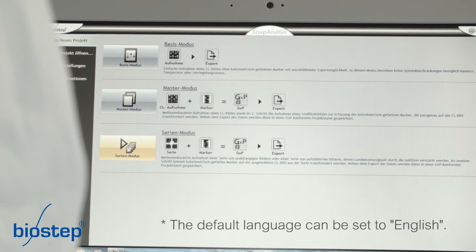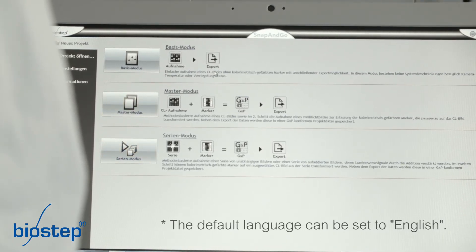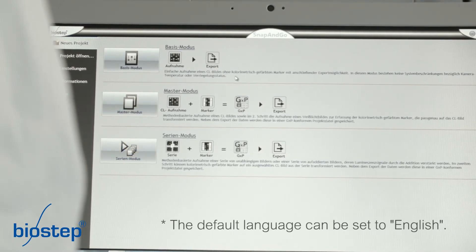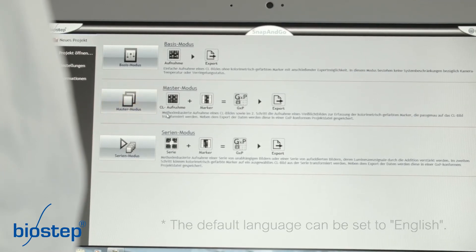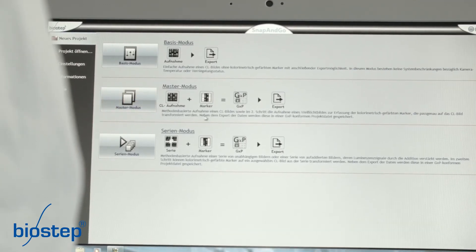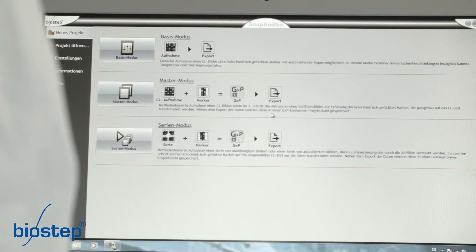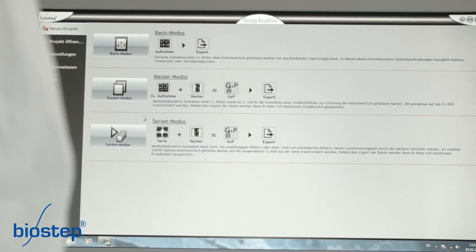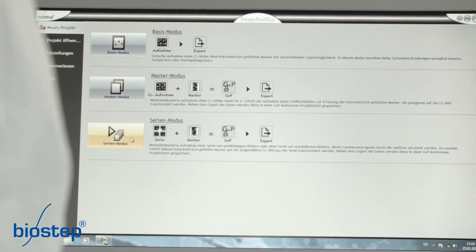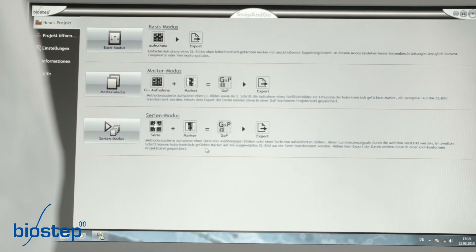The basic mode is for quick imaging without colorimetrically stained marker proteins and is not GXP conform. Using the master mode, you can capture colorimetrically stained markers and integrate them into the chemiluminescent image. The raw data of the image will not be changed.